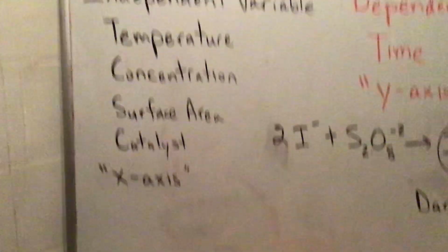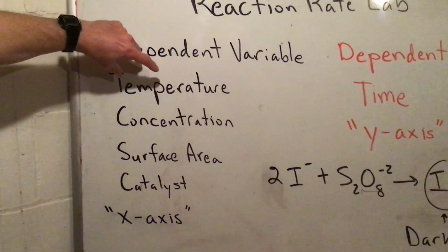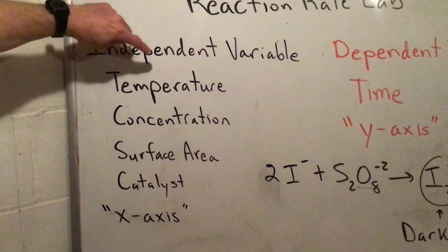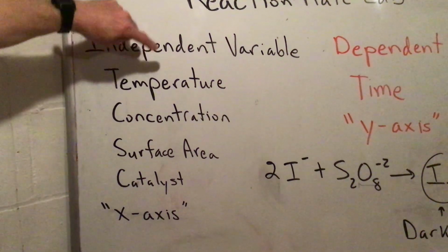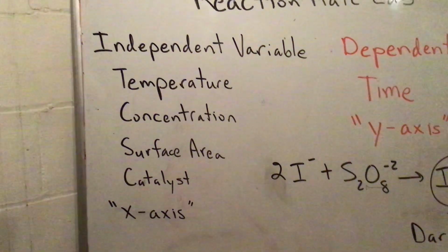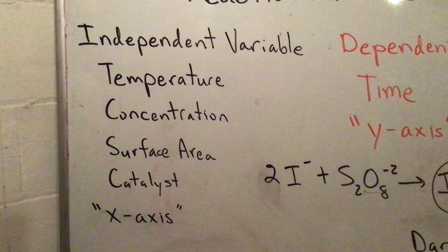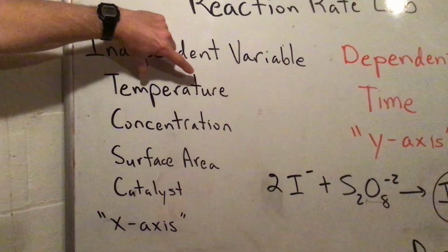Now, if I were doing this, I would try to get at least 4 data points. So I might do one at 20 degrees and 30 degrees and 40 degrees and 50 degrees, maybe 10 and 0 degrees. Try to get a nice spread of data points and see if I can see a trend or pattern.